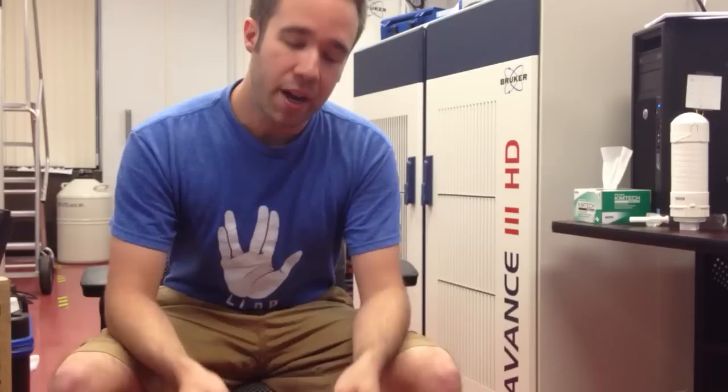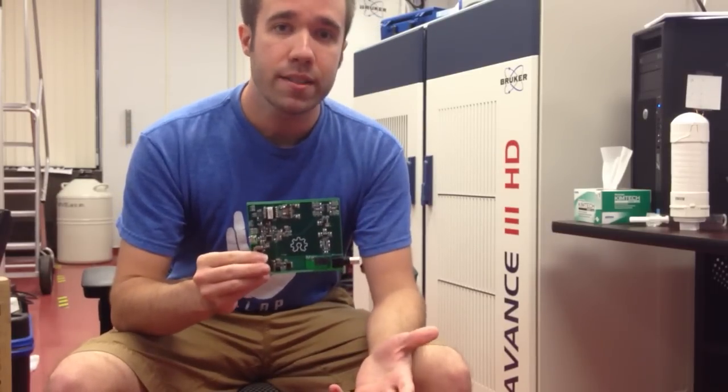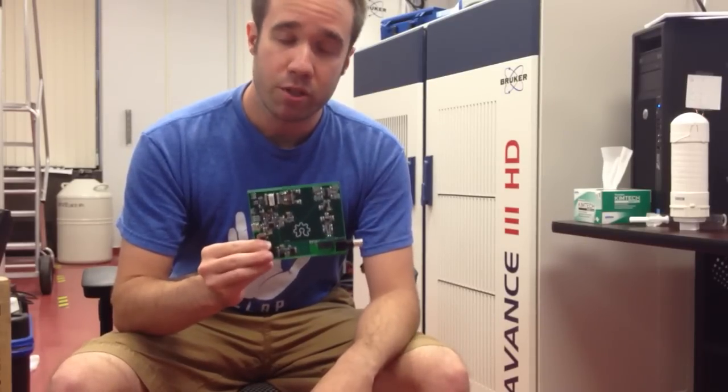Hey Hackaday, my name is Brad and I'm here to talk to you about the Pi PPM. This is my entry to the Hackaday Prize. In a nutshell, it's an Earth's Field NMR Spectrometer. I'll break that down in two minutes or less and give you a little bit of insight about what that is and why it's important.